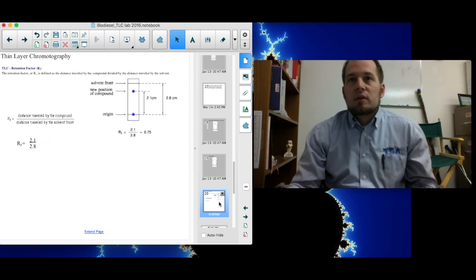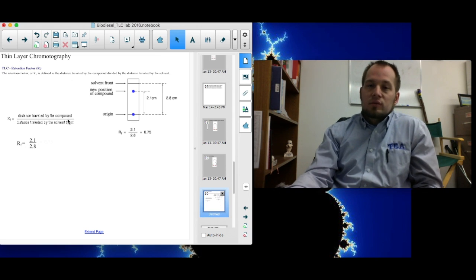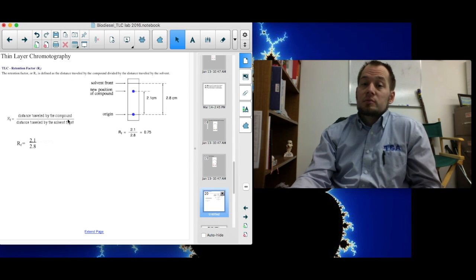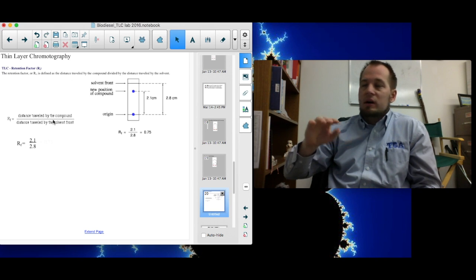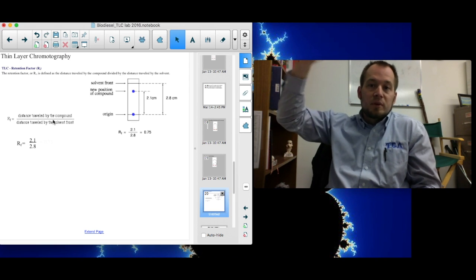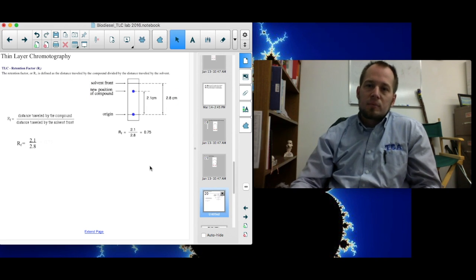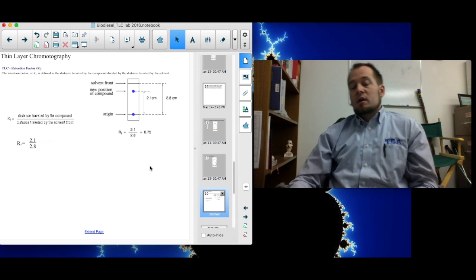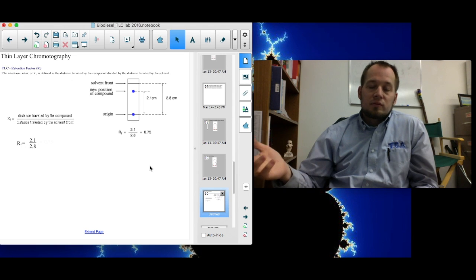So the retention factor would be a formula, and this formula would be given to you on the test, so don't worry too much about that. It would be the distance traveled by the compound, divided by the distance traveled by the solvent, which will always be the bigger number. So you're always going to end up with a fraction, or a decimal, I should say. So in this case, the decimal is 0.75. So it traveled 3/4 of the way up the plate. If we were to do the same thing for the oil, it'd be a smaller number. It wouldn't have traveled as far, so maybe it would be 0.5 or something like that.